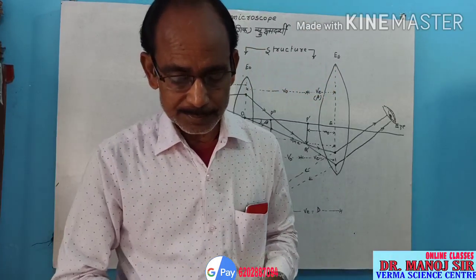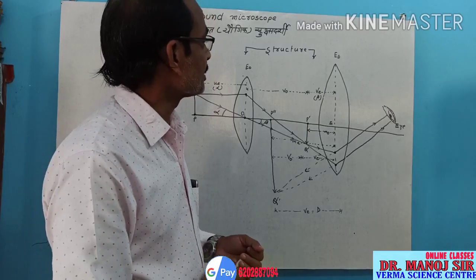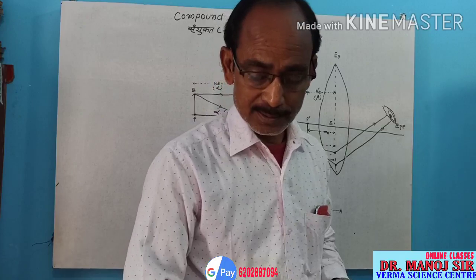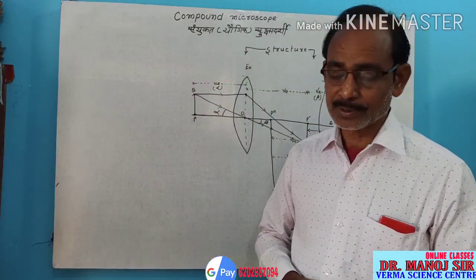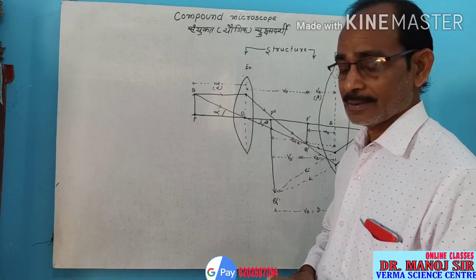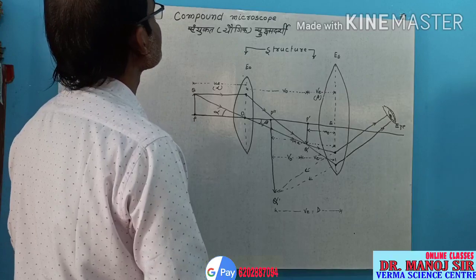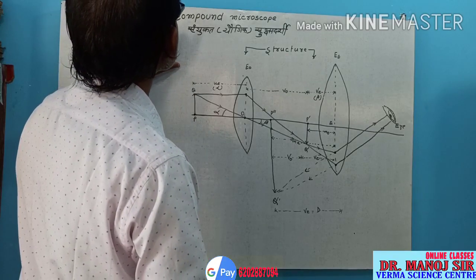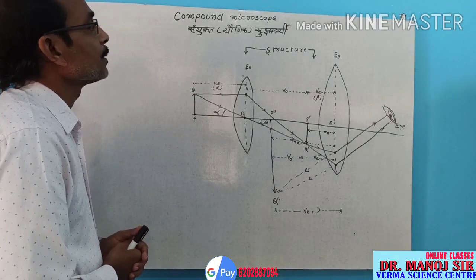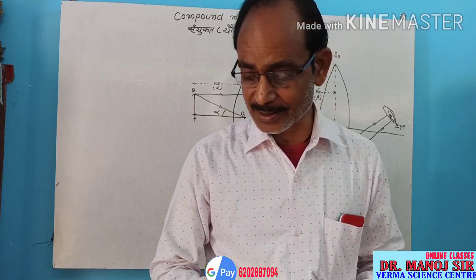Today, the study of optical device, that is compound microscope. In Hindi, संयुक्त सूक्ष्मदर्शी, यौगिक सूक्ष्मदर्शी. This is a device that we have to get function, structure and its magnification.